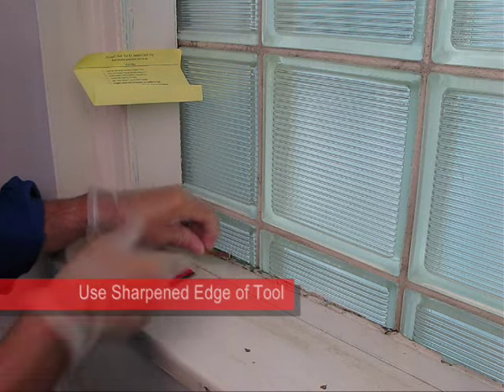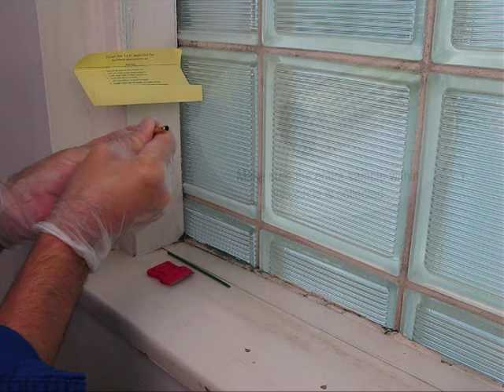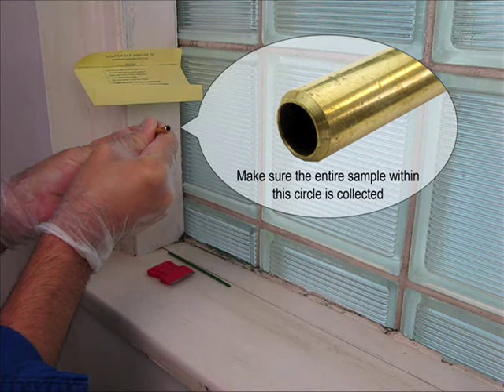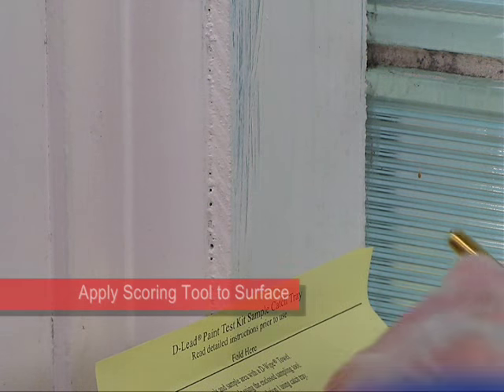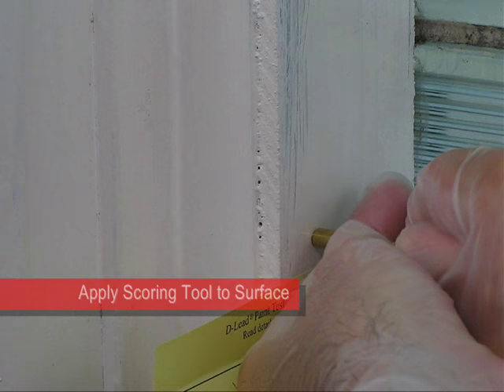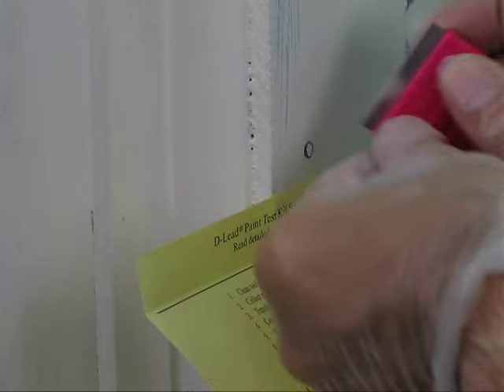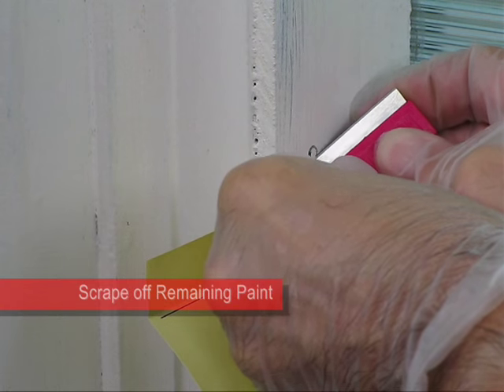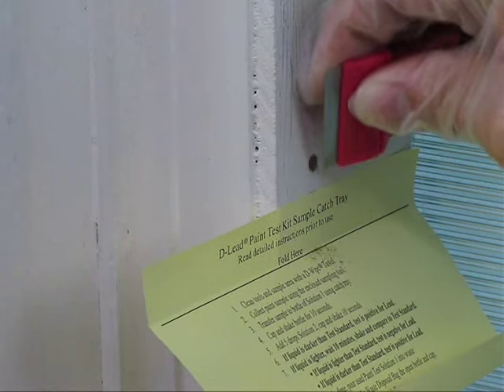Sample size is important to the accuracy of the test. It is essential that all of the paint within the circle scribed by the scoring tool is collected and used in the test. Hold the sharpened edge of the scoring tool against the surface to be sampled. Score a circle through all the paint layers to the substrate by twisting and applying pressure. Scrape any remaining paint within the circle, removing all the paint layers.